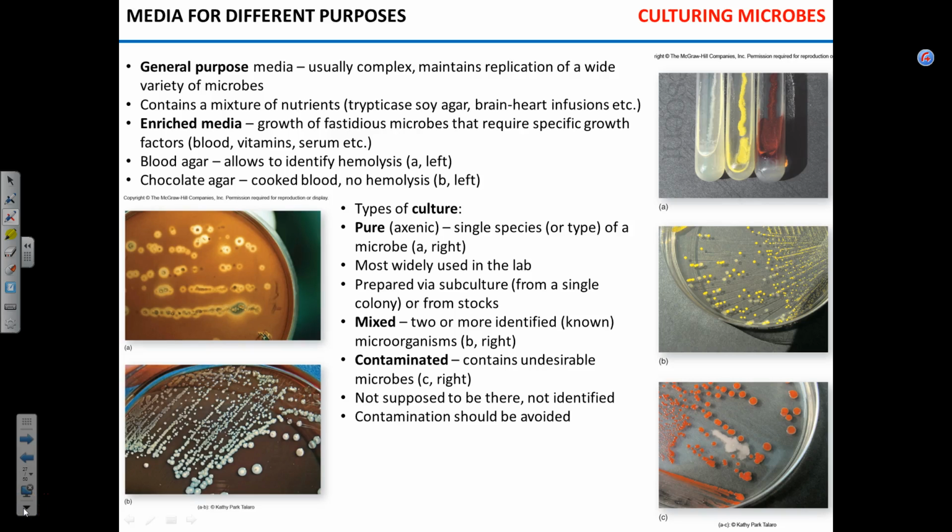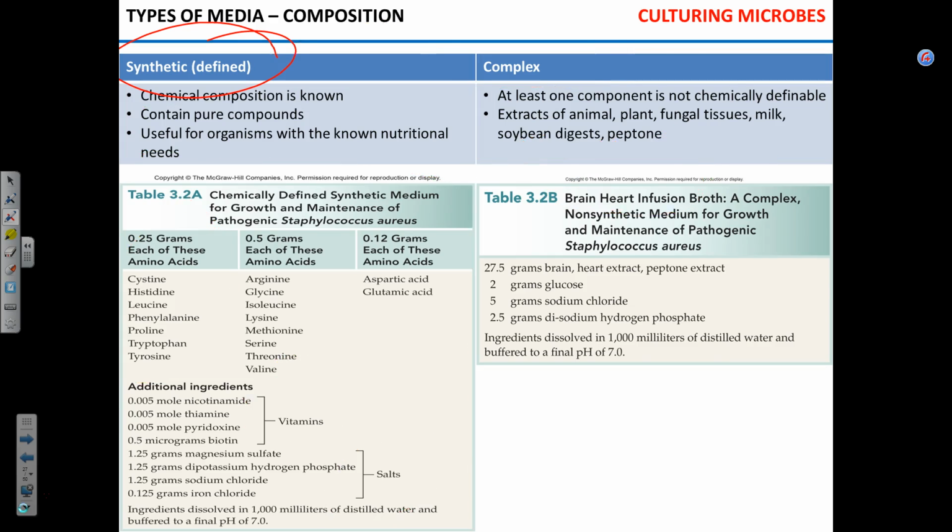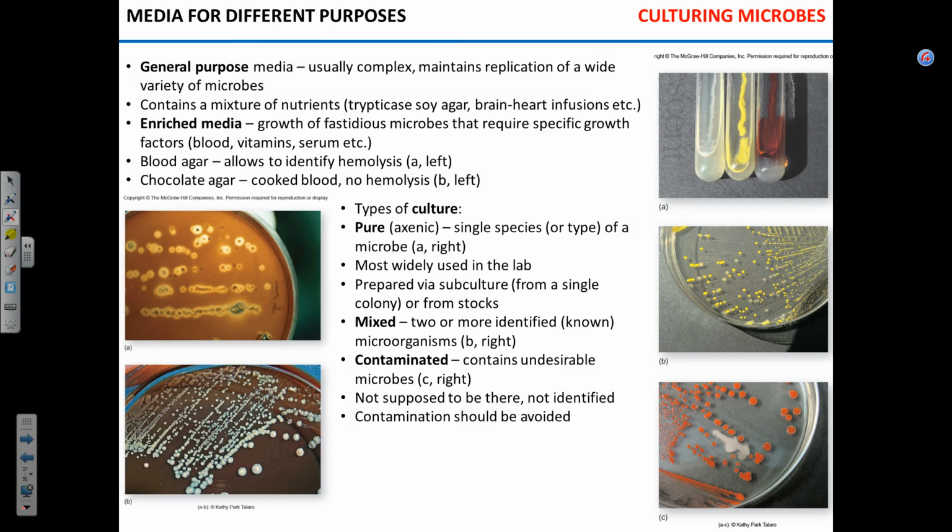So we talked about classification of media based on the physical state. Thank you for reminding. Based on the physical state and based on the chemical composition. So the next thing to focus on is the function of the medium. Okay.